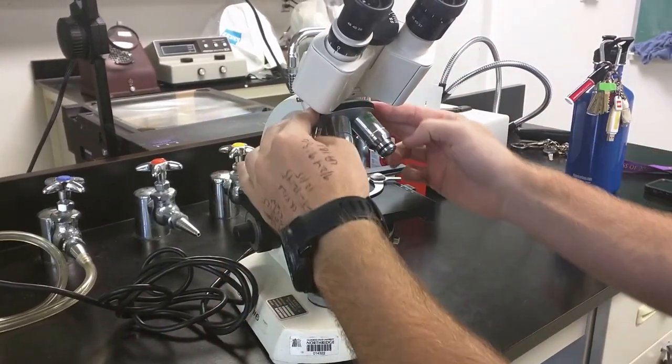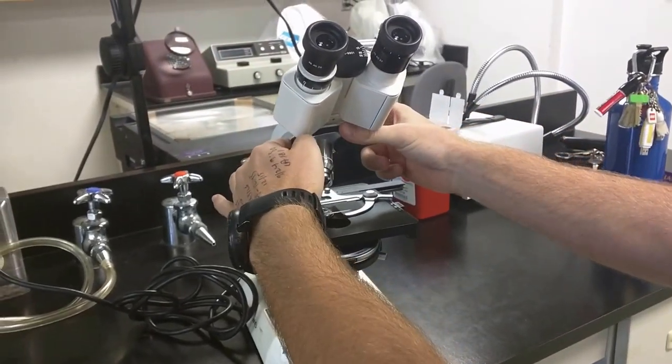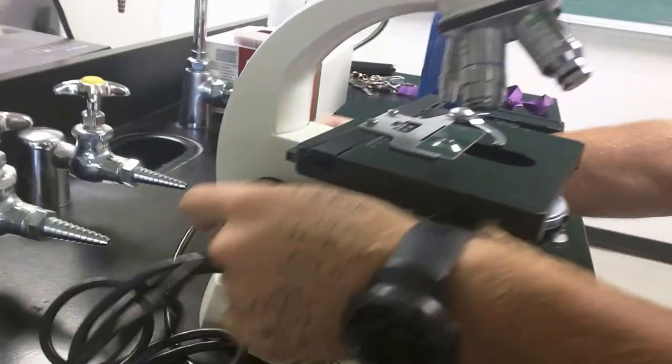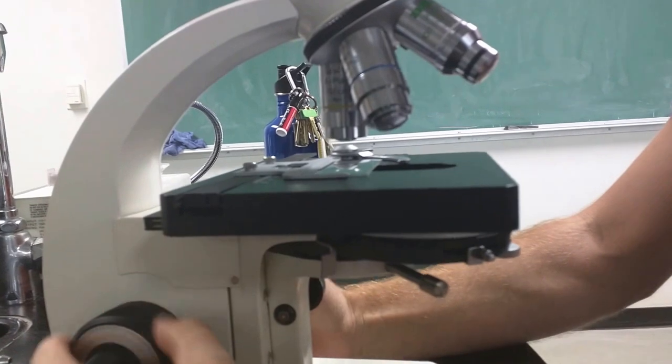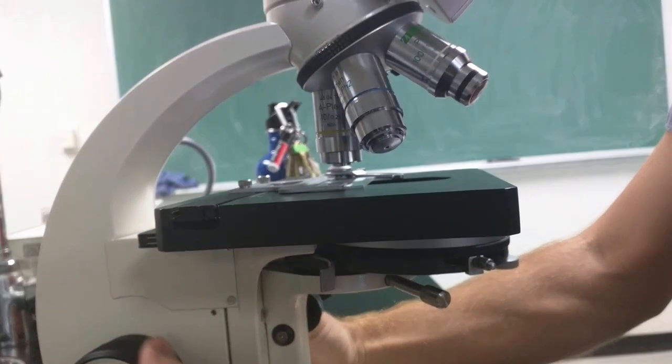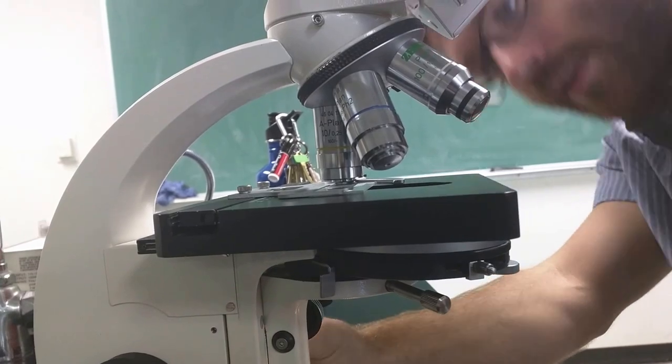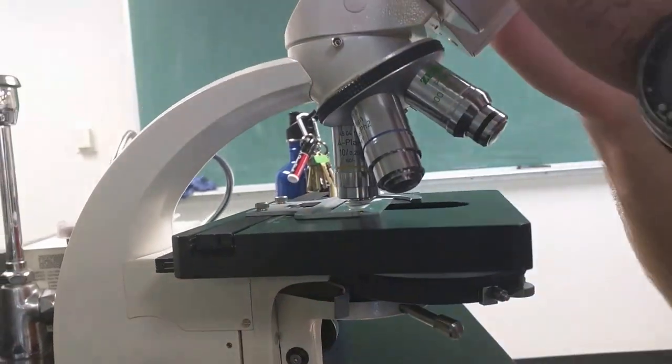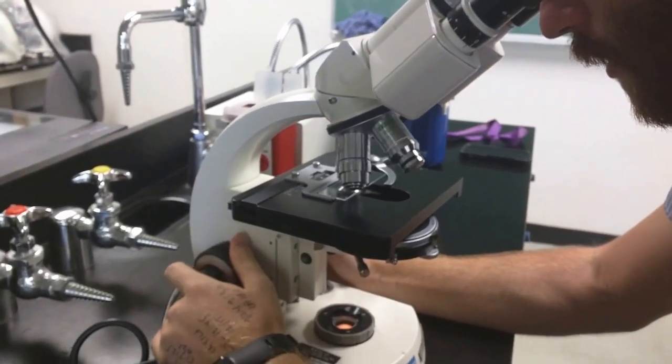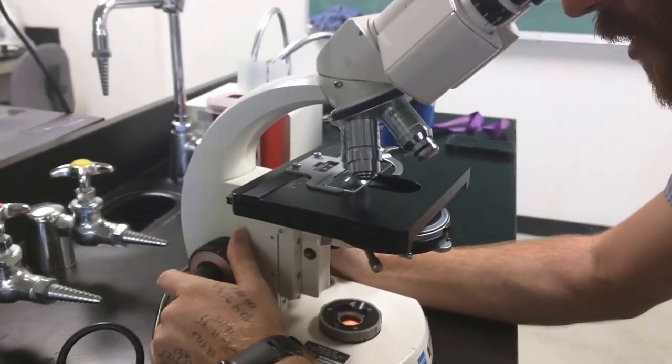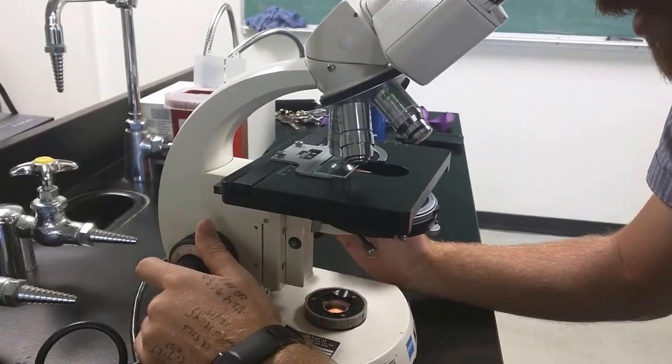Now at this point I'm going to use this rotating disc right here to flip the 10x in place. And as long as the 10x is in place I can raise this stage up all the way and my lens will never hit my slide. Only on the 10x though. And so I'm going to look through these oculars, these pieces right here. And I'm going to focus on the black R that I wrote on the slide. Just slowly lowering it down from the top and there. It looks like a waxy R.